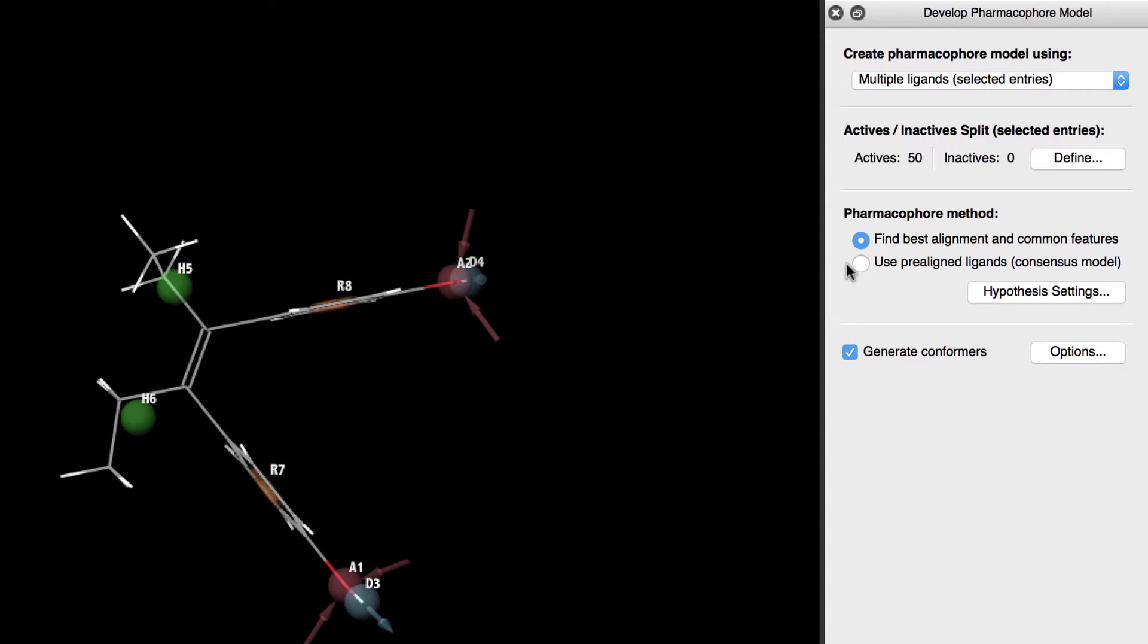There are two methods when dealing with multiple ligands. We covered the process of using prealigned ligands to create a consensus model in a previous video. In this example since our ligands are not aligned we'll use the find best alignment and common features method.